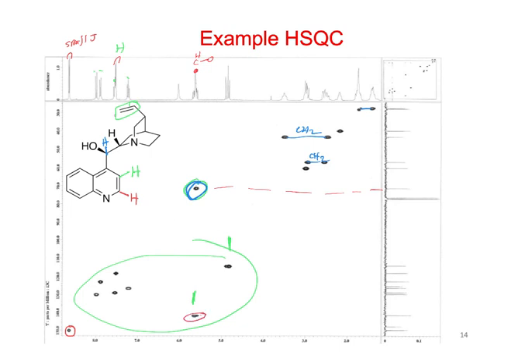This is for the CH right here, and that has more coupling in here underneath. Okay. So those are overlapped in the proton spectrum, but they're far apart in the C13 spectrum.